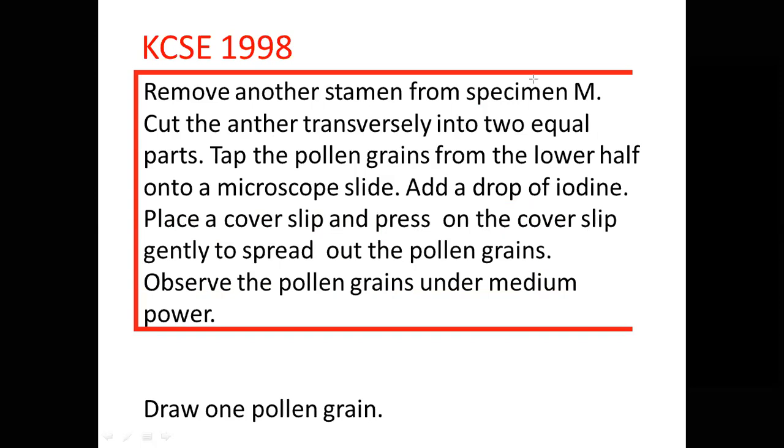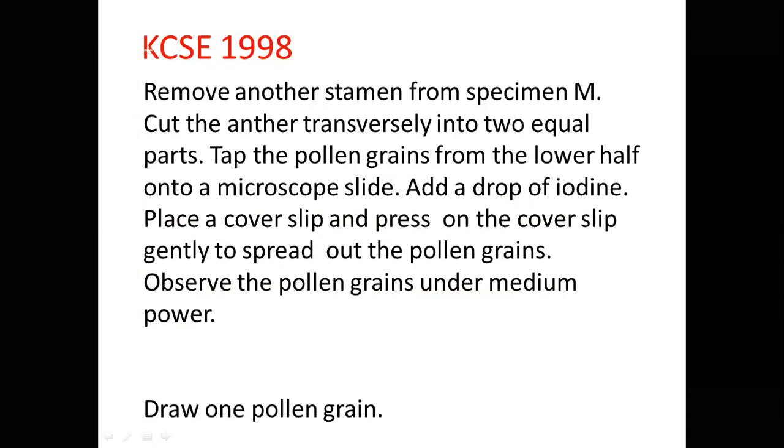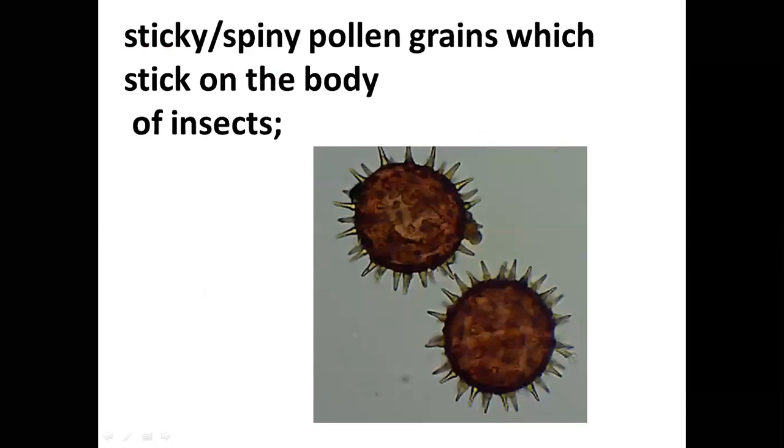And it's something that I've done over and over again, and it is a technique that is very simple. And you see now, those are the pollen grains that you are likely to see. You see, when you press so hard, those hooks, those spines are going to break, and you may not see them.